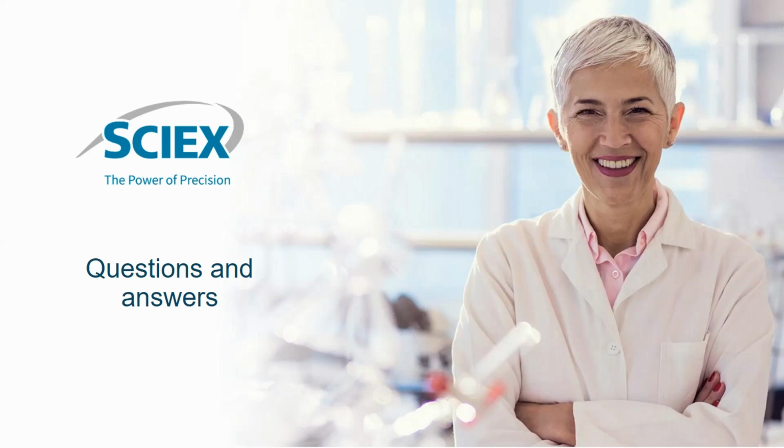Great. Next question here, how is this helpful for compliance for upstream and downstream bioprocessing? So one of the big caveats for upstream and downstream processing is that when you're in early phase or research and development, you're doing a lot of screening and you're doing a lot of high throughput testing. So those are some of the items that we mentioned inside of this webinar. So what happens is that when you're analyzing many different types of sample types and samples, you're going to rely on a method that can do high throughput performance.